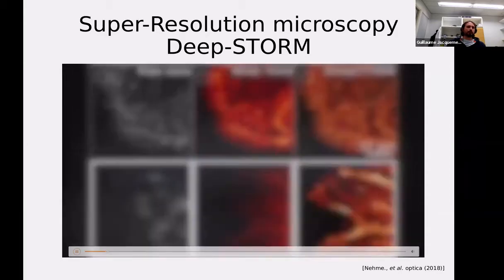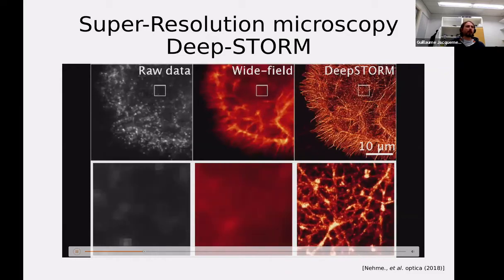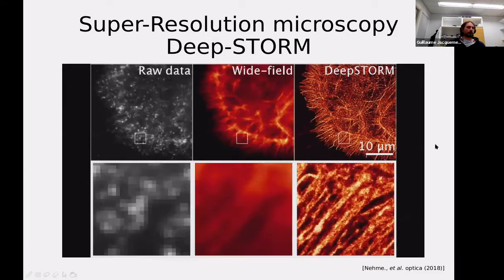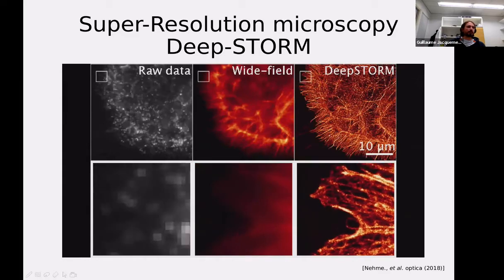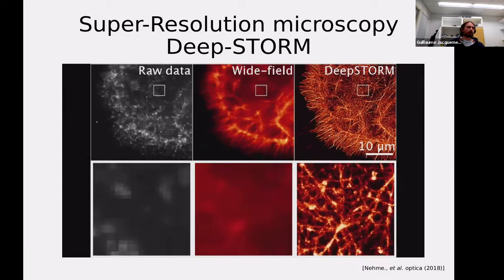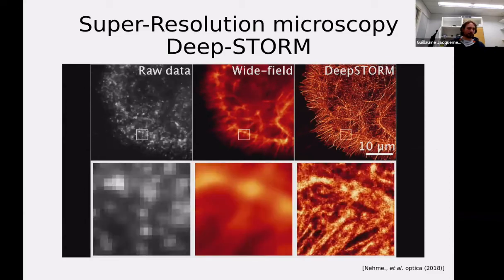If you're interested in super-resolution microscopy, we've also implemented a network called DeepSTORM, which allows you to reconstruct densely packed single molecule localization microscopy data. Those data are actually microscopy data from Christophe Leterrier, who is with us today. So thanks, Christophe, for providing us with really beautiful SMLM data, as always.